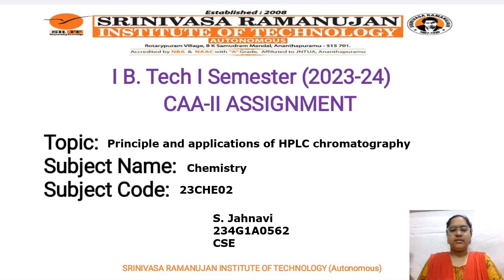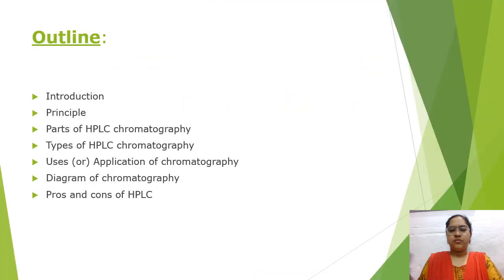Good afternoon, sir. This is Janvi from CSCA section, and my topic for CAA 2 assignment is Principle and Applications of HPLC Chromatography. So now, first outline: introduction, principle, parts of HPLC chromatography, types of HPLC chromatography, uses or application of chromatography, diagram of chromatography, pros and cons of chromatography.